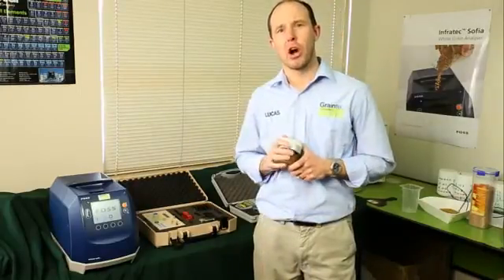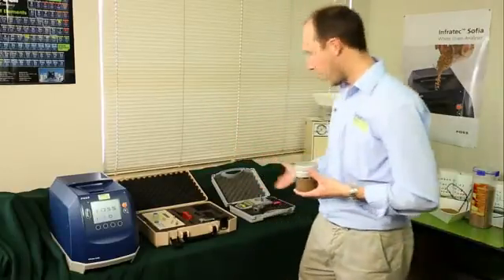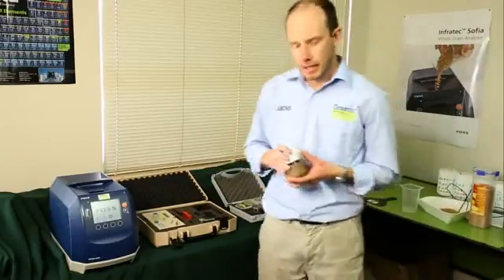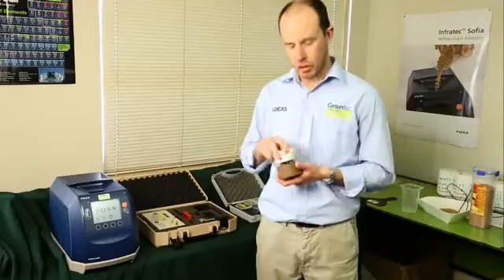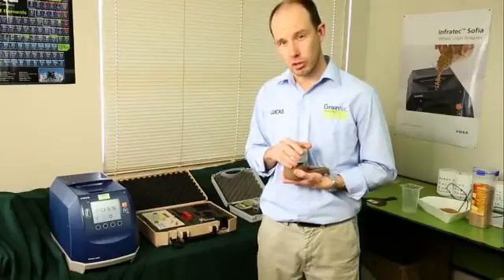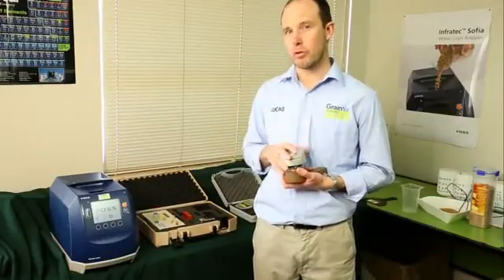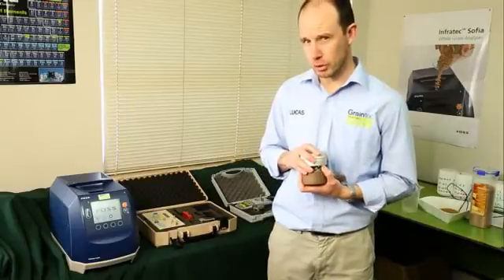If you're getting particularly high moisture readings from a handheld moisture meter like the HE50 or the HE Lite, check that you haven't got any green grains in your sample. Green grains will make your moisture reading artificially high. It's important that you remove all green grains before measuring moisture.